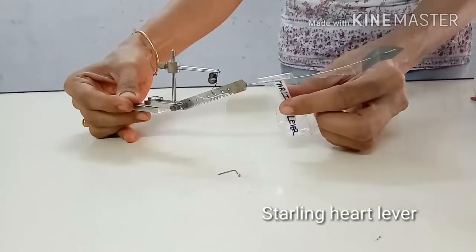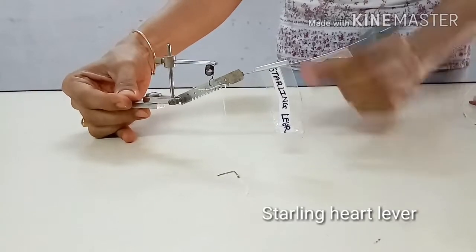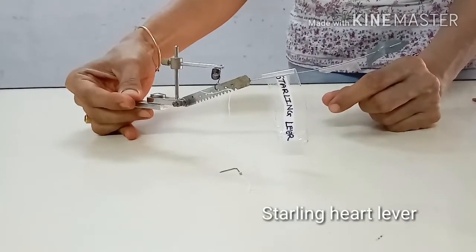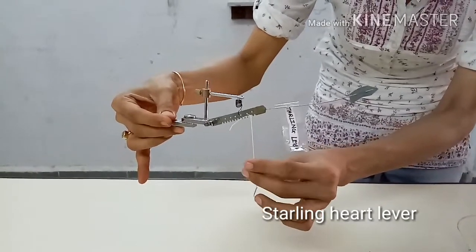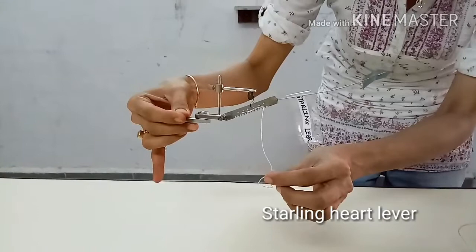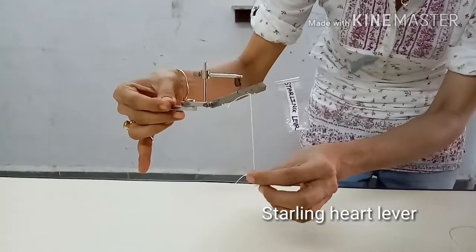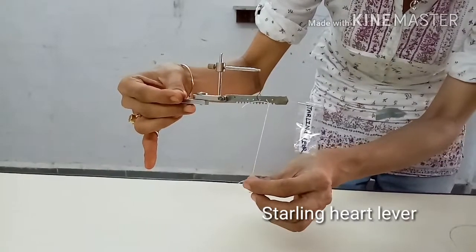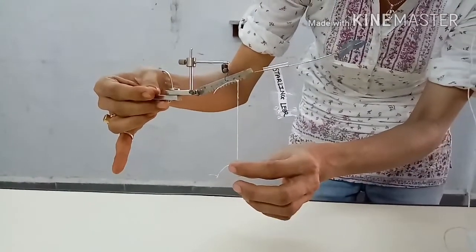This is Starling's Heart Lever. It is used for recording the mechanical events of the frog's heart. It is a sensitive writing lever because of the presence of a spring. This lever is used to record the isotonic contractions of the heart, which are relatively weaker than skeletal muscle contractions. A piece of thread is tied to the lever which carries a bent pin that can be hooked through the apex of the ventricle. When the ventricle contracts, the contractions are recorded by the movement of this lever. When the heart contracts it pulls the lever down, and when it relaxes the spring pulls the lever back to its original position. This lever is mounted on the myograph stand.